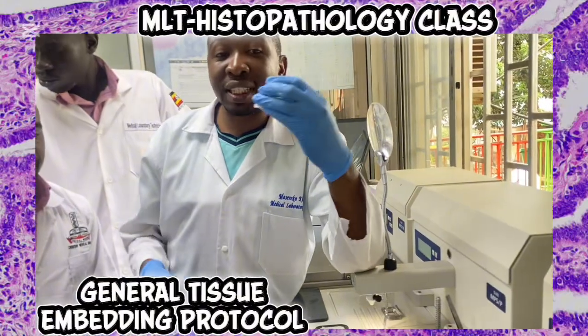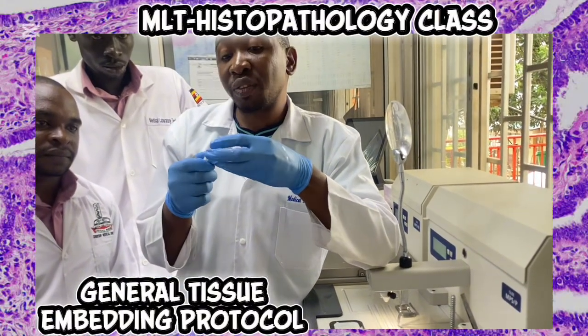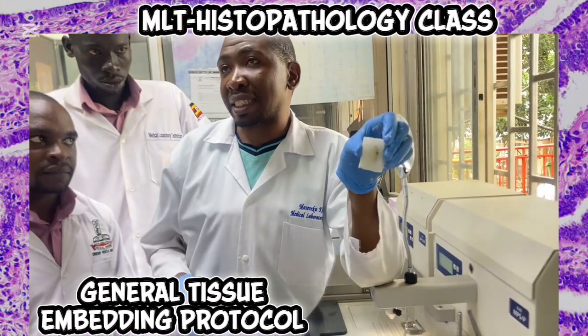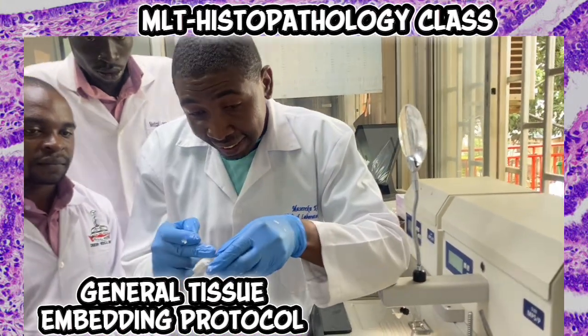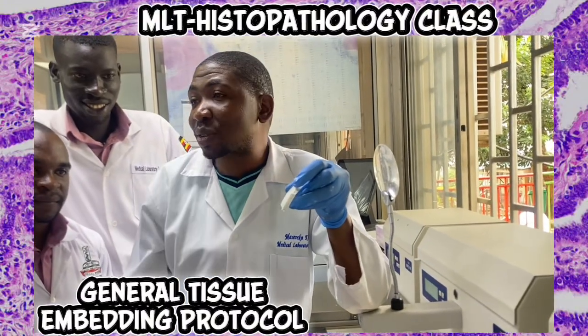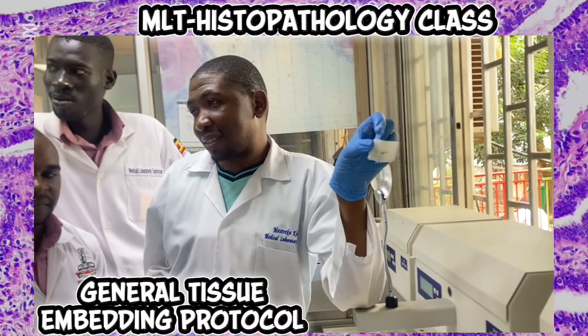So it is your storage that will disappoint you, because if they are not properly stored, they are usually eaten by rats. You find the rat has eaten half of it. So where it ate is where the disease is. Just imagine. That's a gone case.